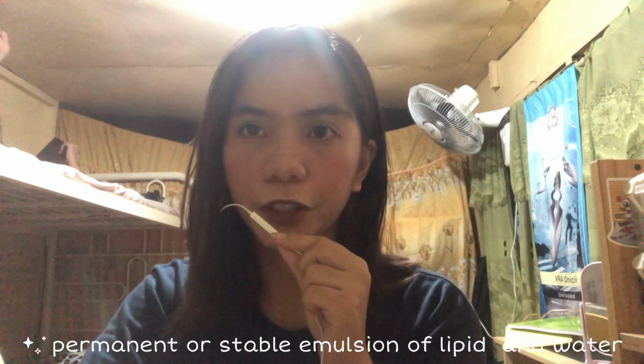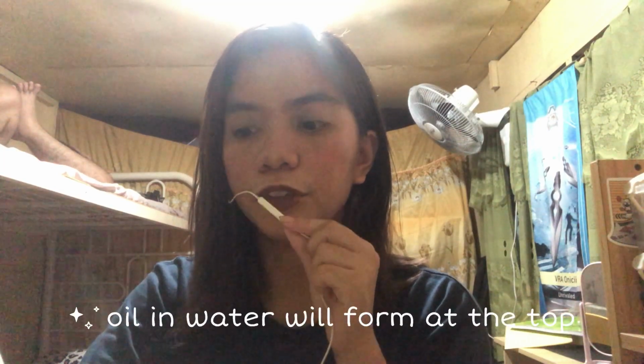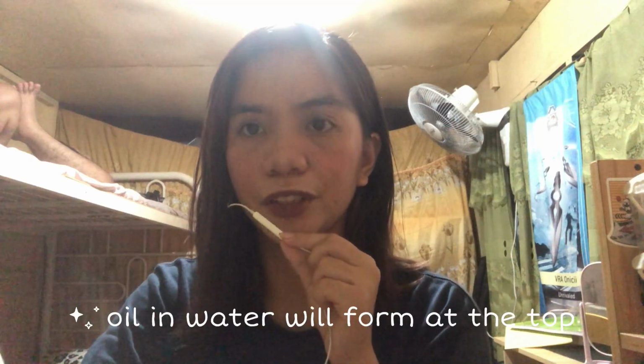Once the liquid has been emulsified by one or more emulsifying agents, it appears as small droplets floating in the solution. It is considered positive or a successful emulsification if there is a permanent or stable emulsion of lipid and water, and it is considered negative if there is an unsuccessful emulsion or if the oil and water will form layers, with the oil at the top, due to the high surface tension of water.